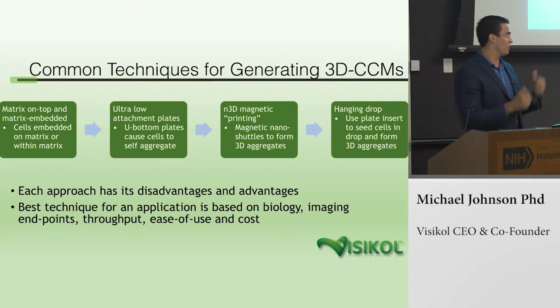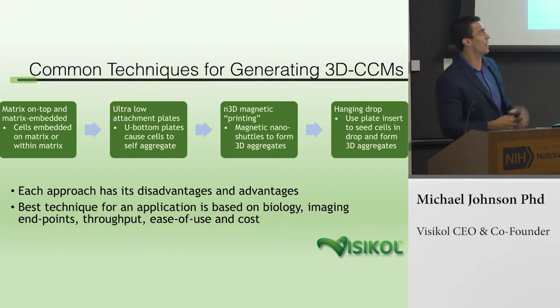And I think it's really important to call this out, and also to call out that all models are not the same. We don't always want really, really complex models, depending upon the type of assay that we're trying to develop. So based upon the research question that a group is going after, for us it really depends upon the model, the project, the throughput, and the cost will vary based upon the type of assay that we're actually going towards and what system we're using to generate 3D cell culture models.